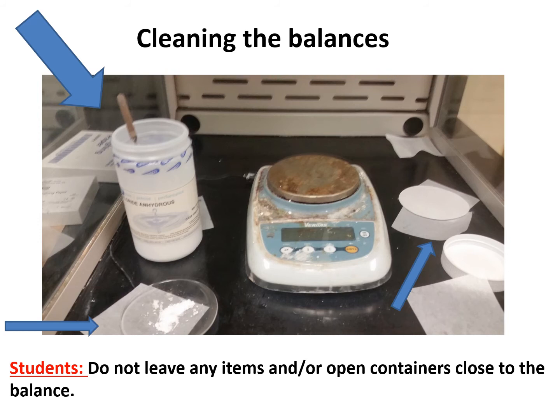And if there's any containers near a scale, they must be closed at all times. If you're weighing something out, weigh it out, close the container, then let the next person use it. And of course, make sure it's clean and there's no spills.